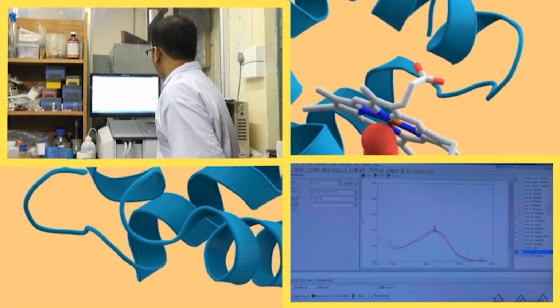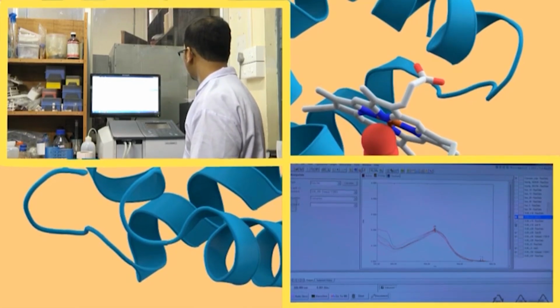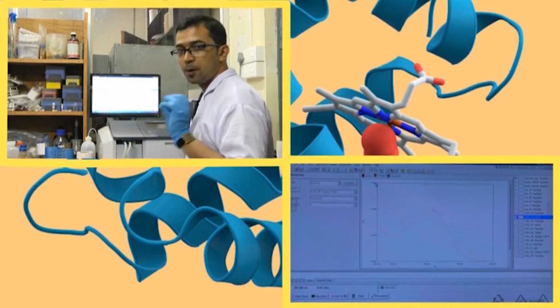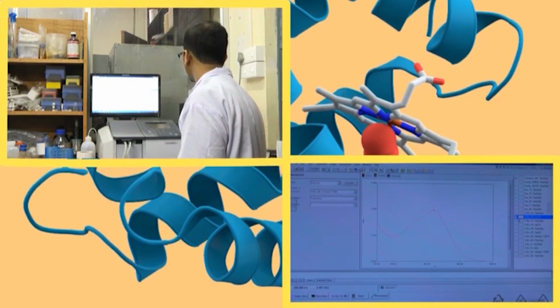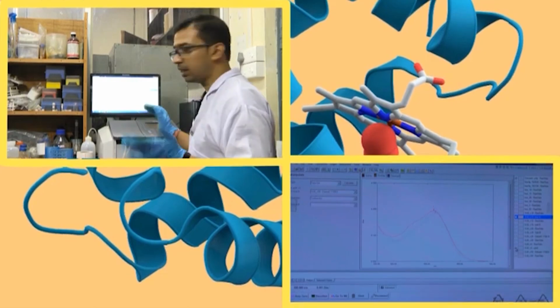So, let us analyze this one. We are now disabling all those spectra, and this one is the spectra for curcumin 0.3. Okay, this is the spectra for pure curcumin. Now, once we have added HSA, the actual value is not this one, okay, the subtracted one. The next value is the subtracted value. So, this one is actually the intensity decrease.